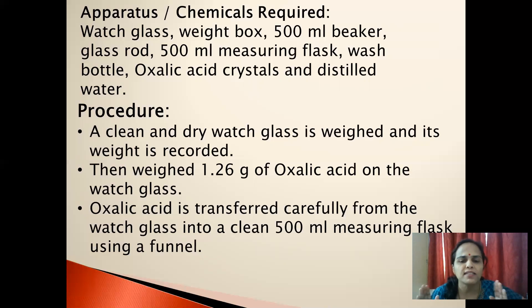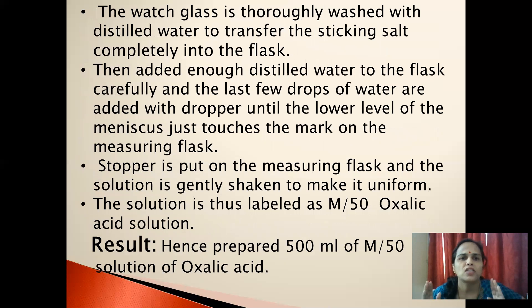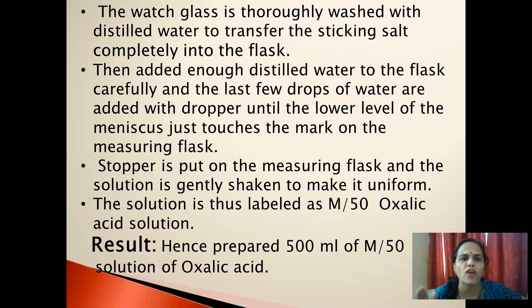Oxalic acid is transferred carefully from the watch glass into a clean 500 milliliter measuring flask using a funnel. The watch glass is thoroughly washed with distilled water to transfer the sticking salt completely into the flask. Then add enough distilled water to the flask carefully, and the last few drops of water are added with a dropper until the lower level of the meniscus just touches the mark on the measuring flask.